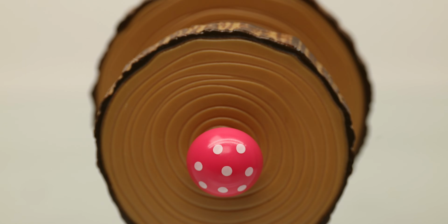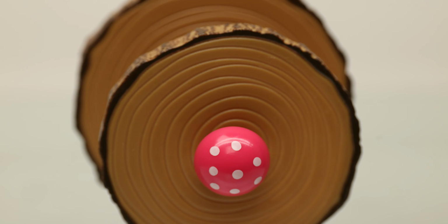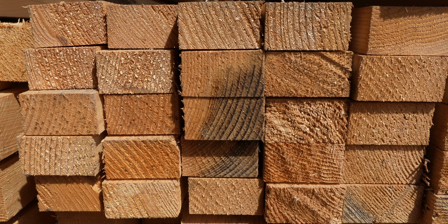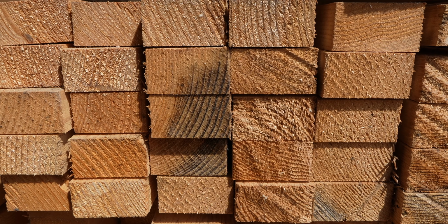All trees grow radially outward, so the microstructure varies in the different directions. The microstructure is stronger if loaded vertically. Because of this, wood used for construction is cut perpendicular to the ring growth.